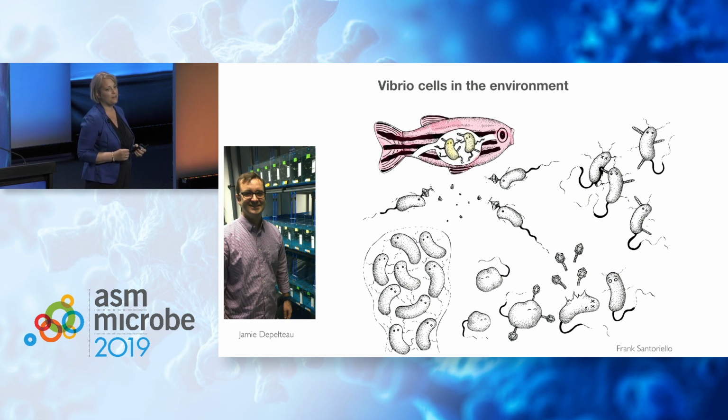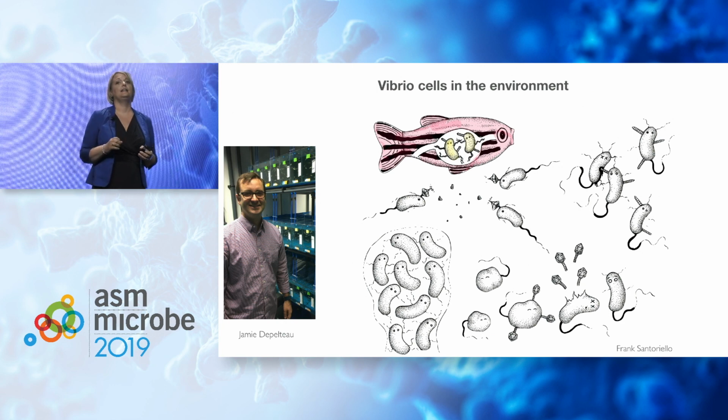Now, this is a very, very challenging question for cryo-electron tomography, because the samples that we need to insert in the microscope have to be 500 nanometer or thinner. And a zebrafish is certainly bigger than that. So at the moment, we address this question by a different type of electron microscopy.